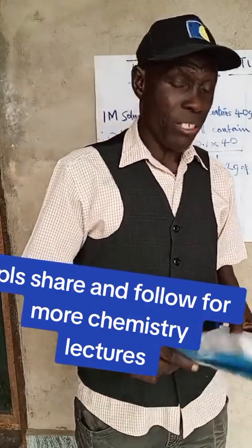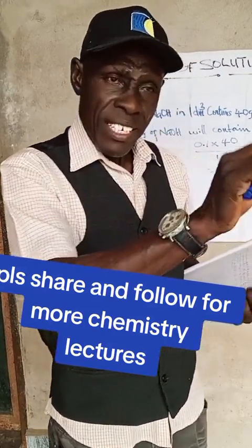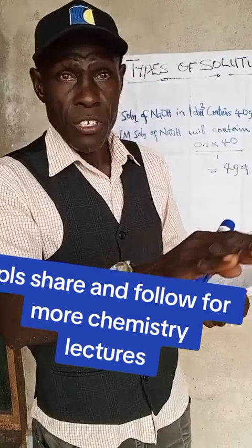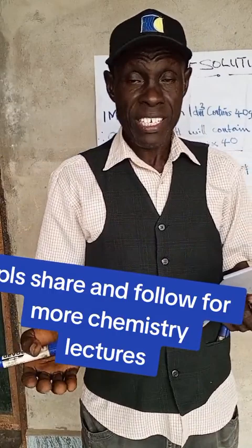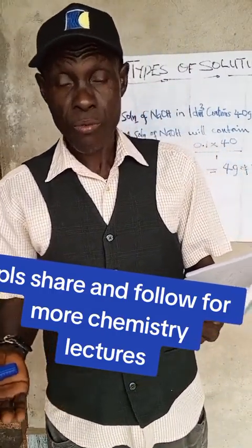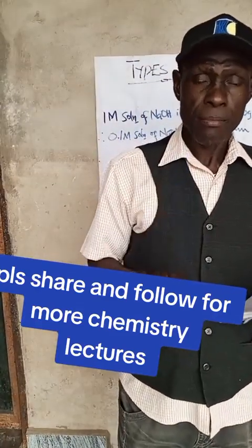And these things we're talking about are very important, because if you don't know how to read the calculations on the volume of the cylinder, it means you won't be able to prepare the correct or accurate volumes of water needed. So I will stop here for a while.